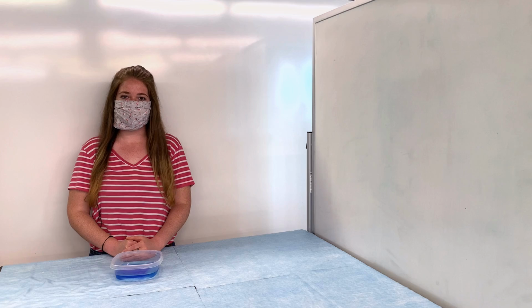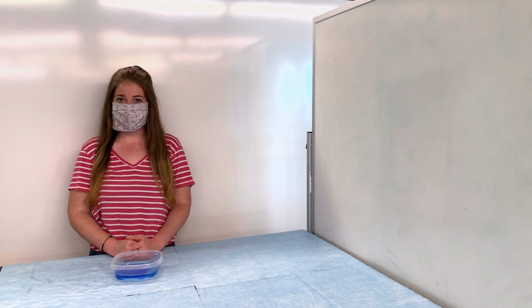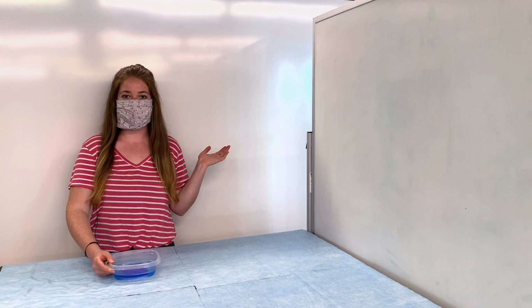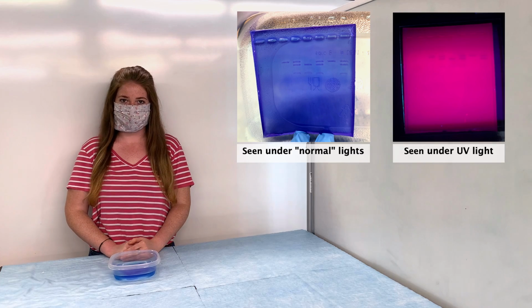Okay, so the samples have been allowed to run through the gel for 35 minutes and they've been stained. So we're ready to look at and discuss the results. I know you probably can't see the gel that I have here, so I'm going to put some pictures up next to me so you can look at what I'm talking about while we go through the results.